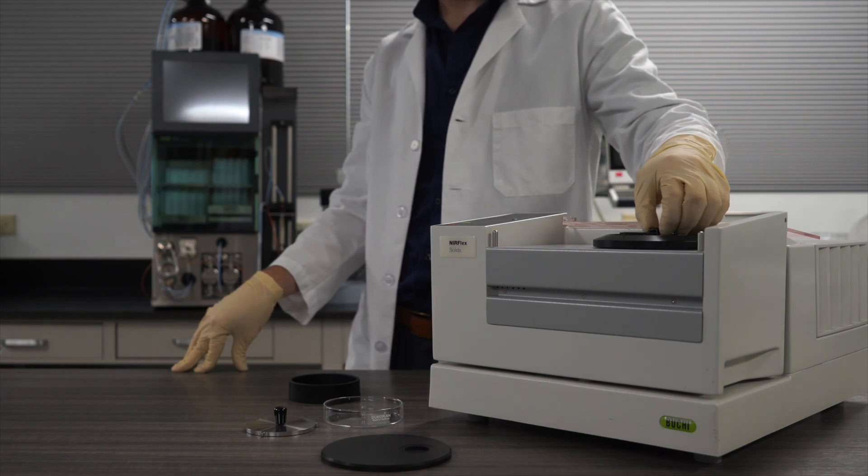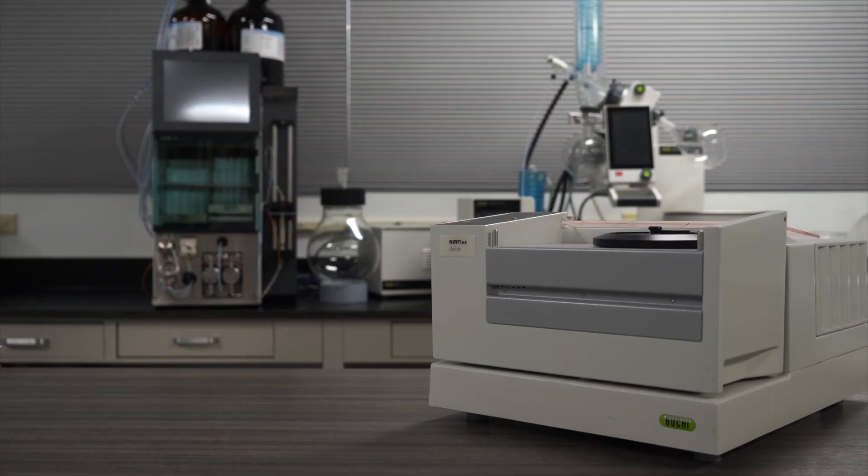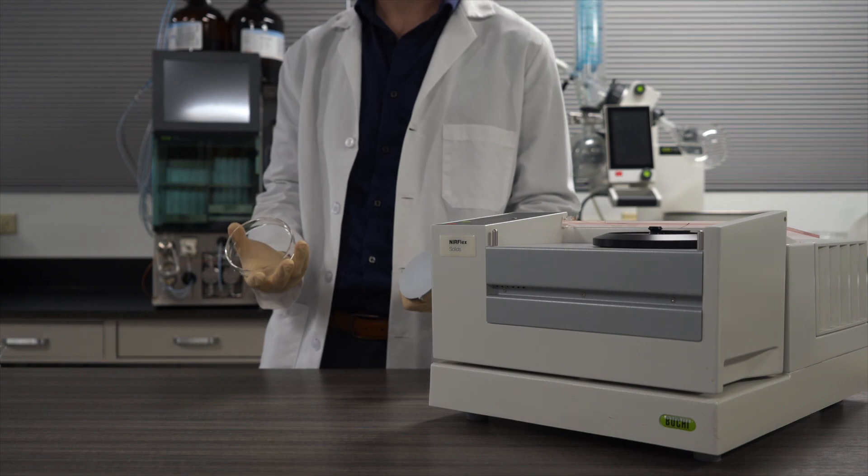The solids module is arguably the most versatile module we offer, and it also gives you the capacity to work with liquids.